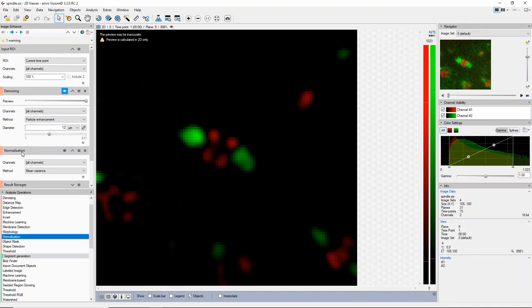But unfortunately, it's a fact of life that in light microscopy, in imaging in general, you can't always guarantee perfectly reliable degrees of intensity throughout the image stack. And so the normalization can help with this.